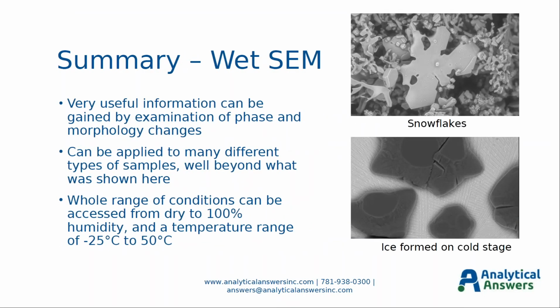So just to go for a very quick summary, it's very useful for looking at the morphology changes and phase changes in different materials as we change the saturation of those materials, and we can look at very high magnifications. I gave only a few examples here, but really it can be applied to many different types of samples. I can't even think of the full list.